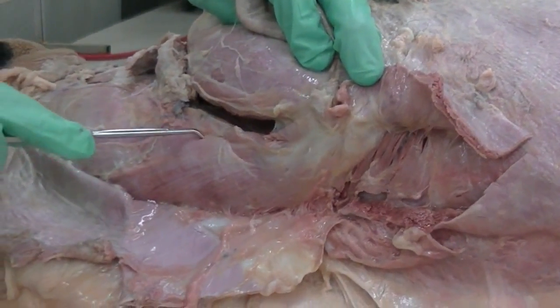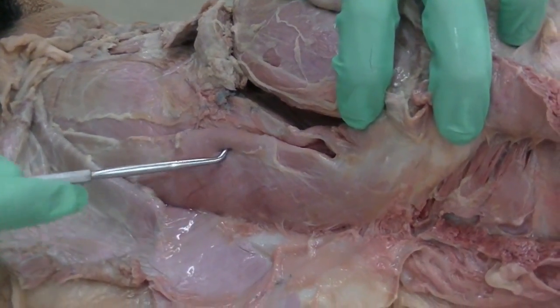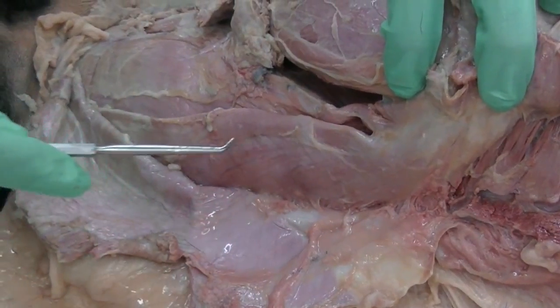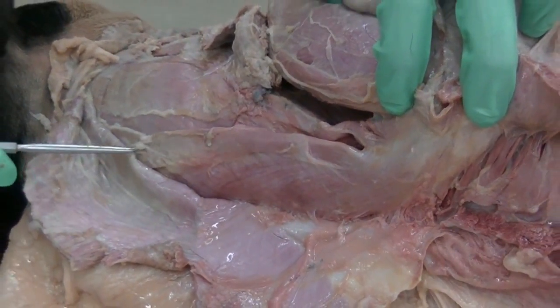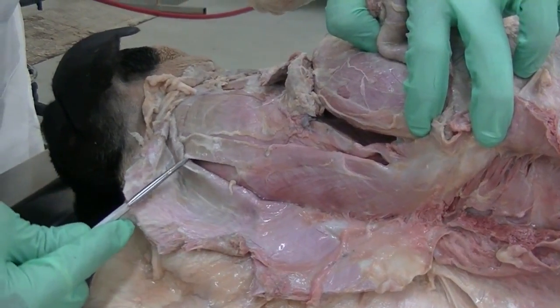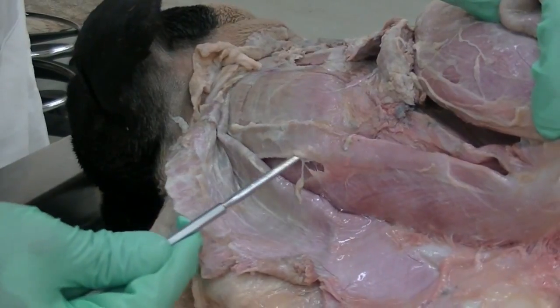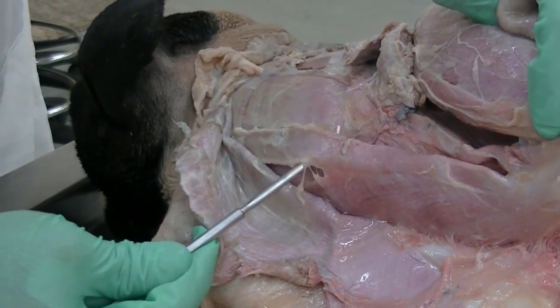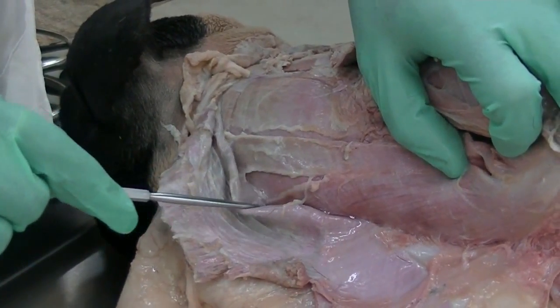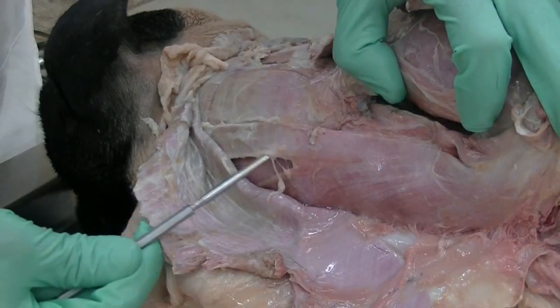The part of the rhomboideus which continues further cranially, as long as it is associated with the neck, is called rhomboideus cervicis, and the part which continues even more cranially to get attached to the skull is called rhomboideus capitis. So the thin strip-like muscle which can be differentiated more cranially from the rhomboideus cervicis, that is the rhomboideus capitis.